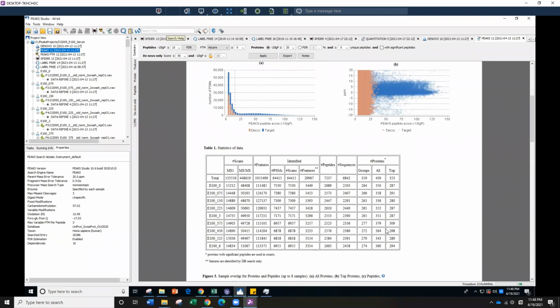That will be your standard. And if you're looking at my data, you will feel like, oh crap, what did I do wrong? But this is actually not too bad for me, because I'm running serum samples, and we know serum has a dynamic range issue. Low protein identification is a common problem with unfractionated serum, and I run it unfractionated.